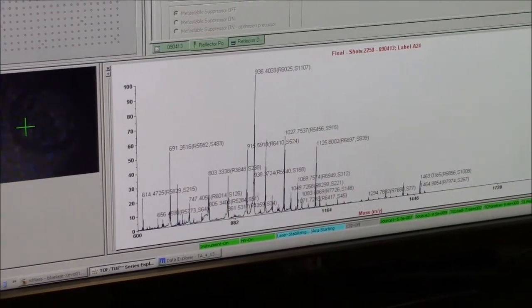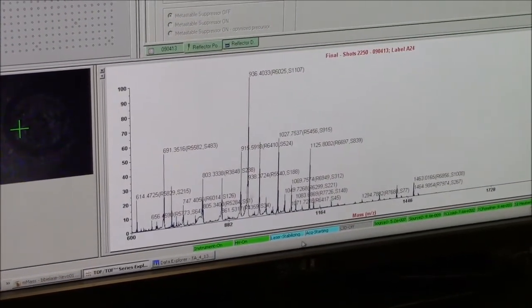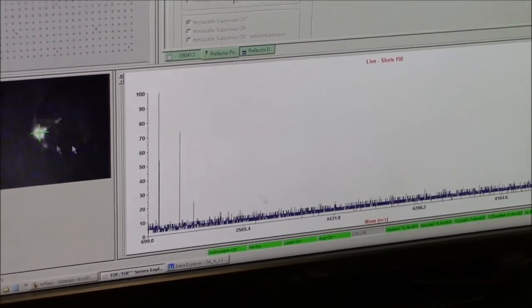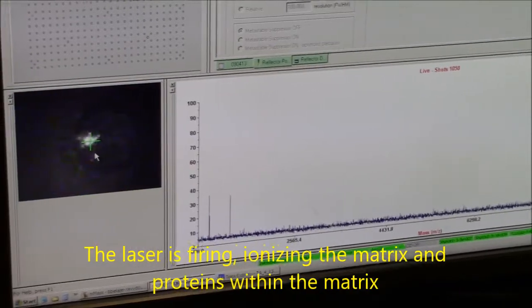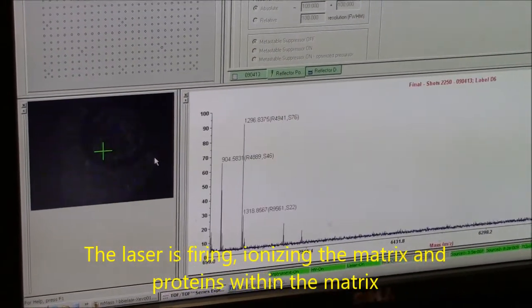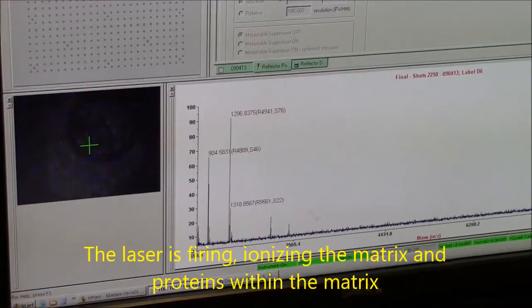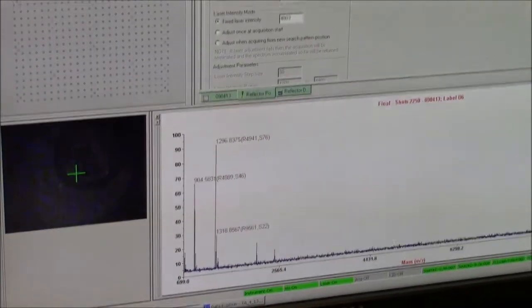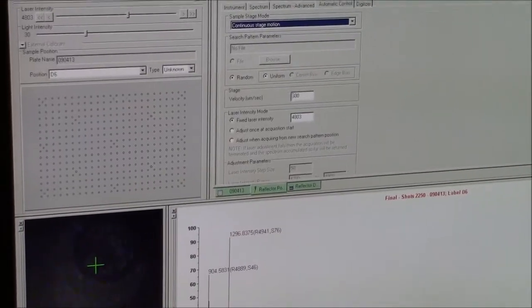I was telling you, it's a pretty powerful laser. It's a pretty strong potential, so it takes a while for it to charge it up. So you can see physically firing the laser, right? My goodness. As you can see, it's moving around. I got set up for the automatic method to do a random walk at this speed for the stage. There's not really any reason to play around with that stuff.